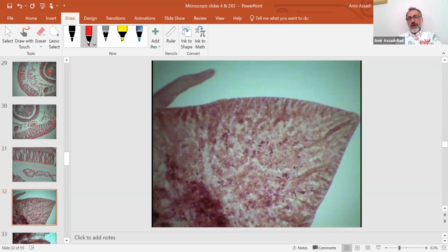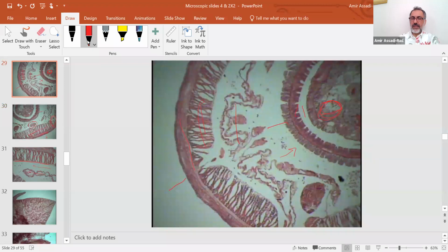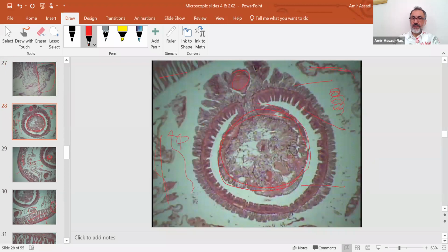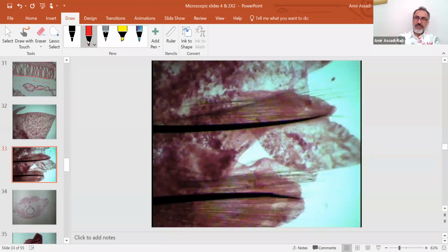This is parapodia of Nereis virens, class Polychaeta, and the earthworm is class Oligochaeta. Remember that: class of the earthworm, Oligochaeta; Nereis, Polychaeta. These are all setae. This is aciculum right here. All of these setae are attached to aciculum right here.